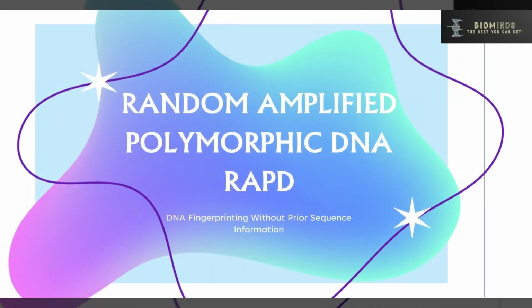RAPD is a powerful PCR-based technique that uses short, random primers to amplify multiple regions of the genome. The resulting DNA band patterns act like unique genetic fingerprints, allowing researchers to compare individuals and detect genetic variation.